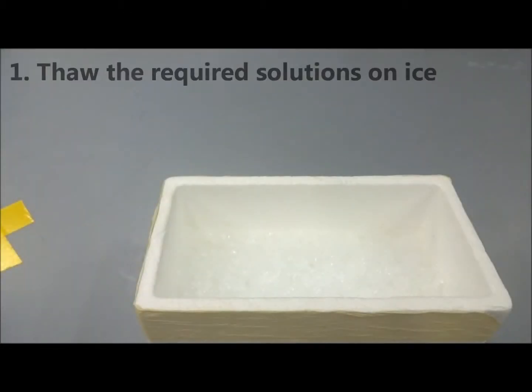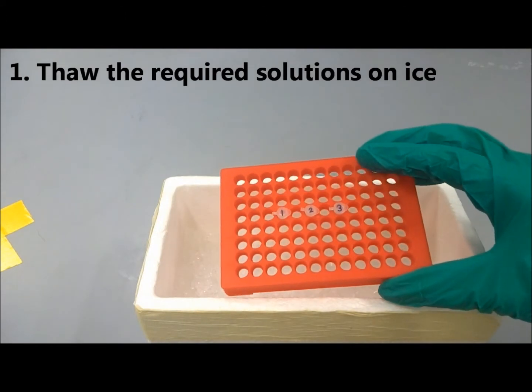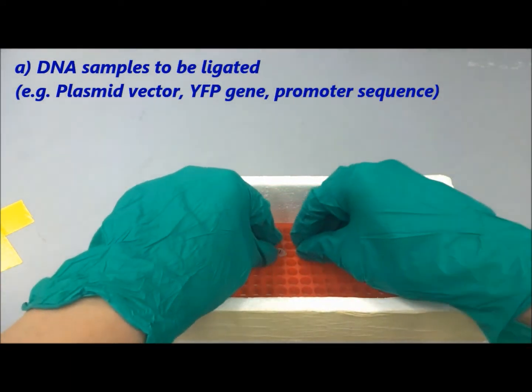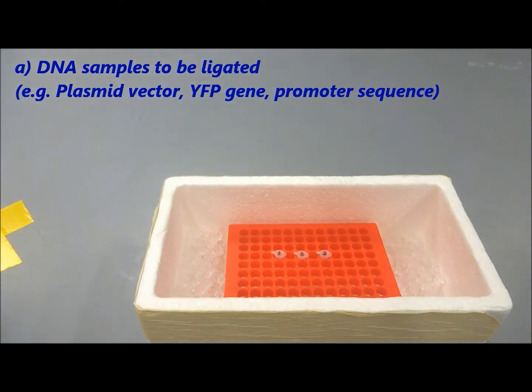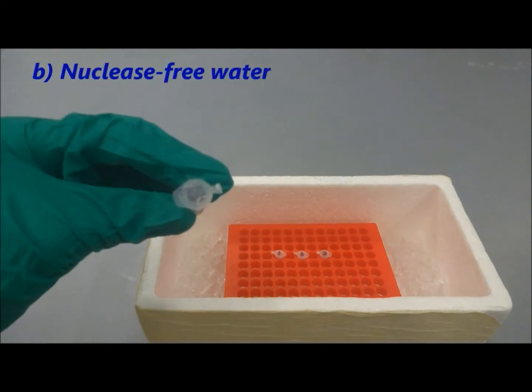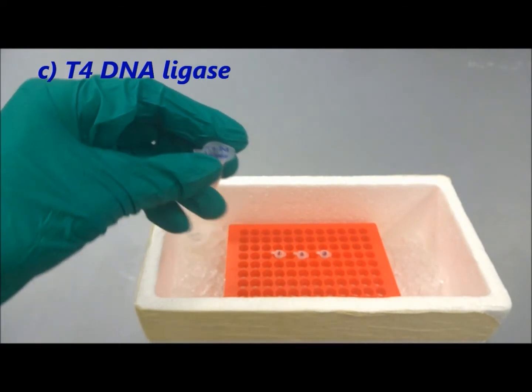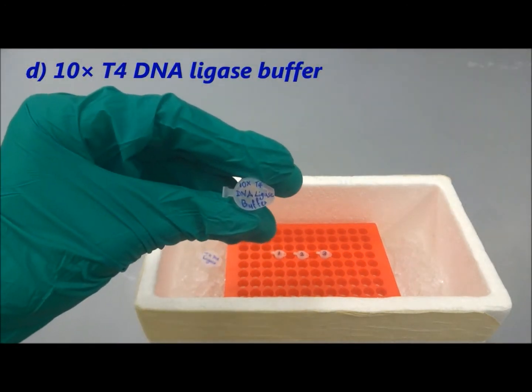First, prepare the required solutions in an icebox. You need the different DNA samples to be ligated. In this example, the plasmid vector, the YFP gene, and a promoter sequence will be ligated. You also need the nuclease-free water, T4 DNA ligase, and the 10 times T4 DNA ligase buffer.